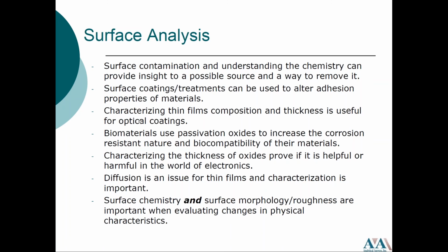The second to last thing we talked about was diffusion of a substrate into a thin film, and understanding that it's crucially important to use SAM to understand what's going on there, simply because it may affect your solderability, as well as maybe apply to why your wire bonds are failing, just as examples.